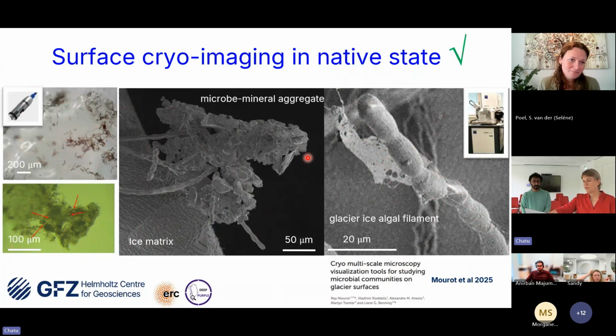But what we don't know is actually, how do they look inside? What happens with them inside? How can we reproduce this and actually do it better in a different way that we can also look at, for example, ultrastructure to understand a different kind of process? And that's why I'm passing it over to Chatu, because he will more or less take you from that part all the way to how to image algae in a different way. Chatu.